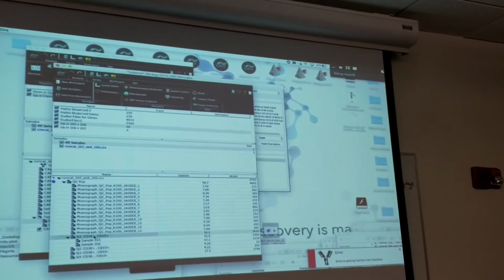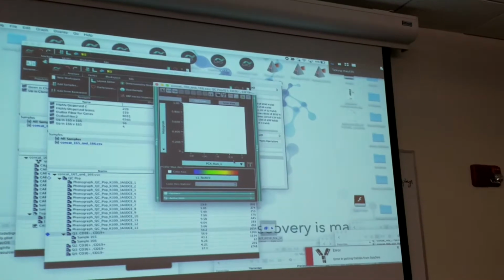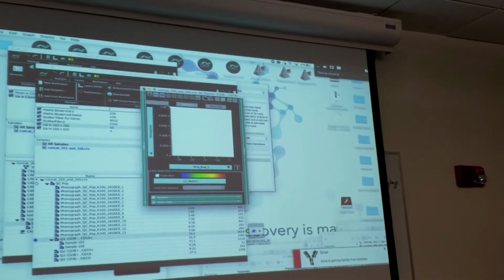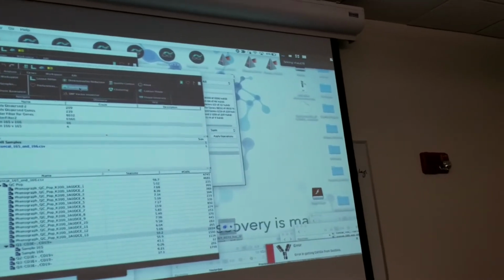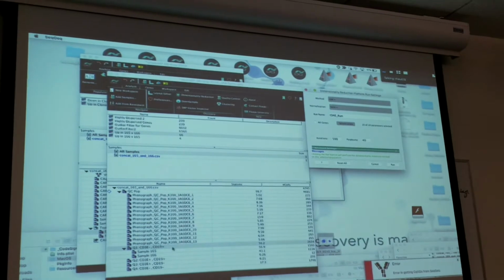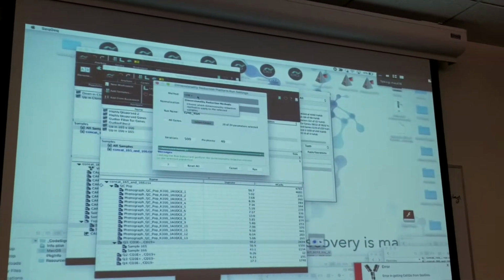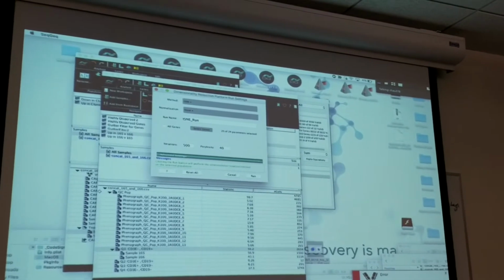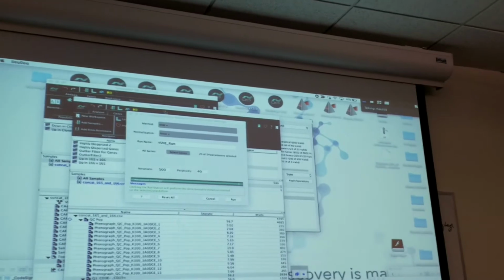It won't matter for identifying what the heavy variable region is, but it would matter when I want to get the right sequence that's in the B cell to make an antibody from. And I would not use those V regions that look like there's an error. But that's another thing. It's not too far off, because that's what I want to do next.